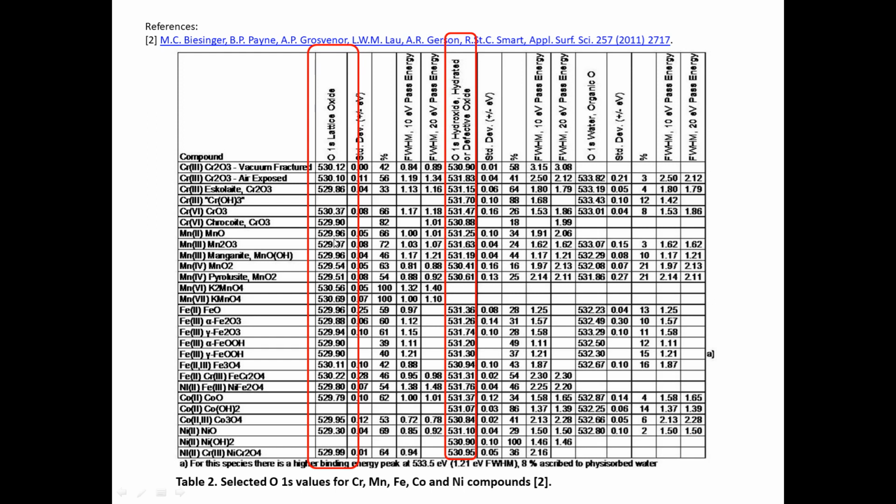For many of the pure oxide samples, there is a second higher binding energy peak that can be ascribed to contributions from a defective oxide or hydroxide, or from carbonates, as their binding energies are quite similar, between 531 and 532. Their peaks often overlap with each other.